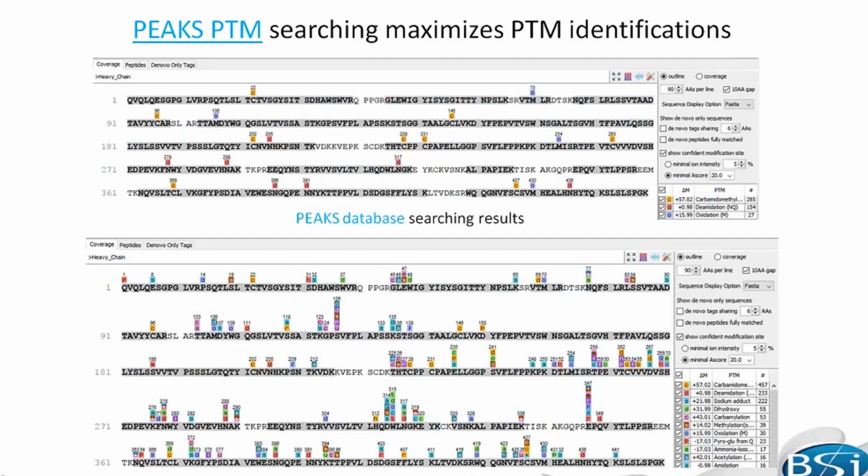Yeah, and just to summarize here, when you use PEAKS PTM, you can get a bit of a cluttered display, as we saw on the previous page. So here's a comparison of the identifications that were made with database search as well as PEAKS PTM. You can see that a lot more modifications were assigned, but remember that all the modifications assigned here are within our A-score of 20.